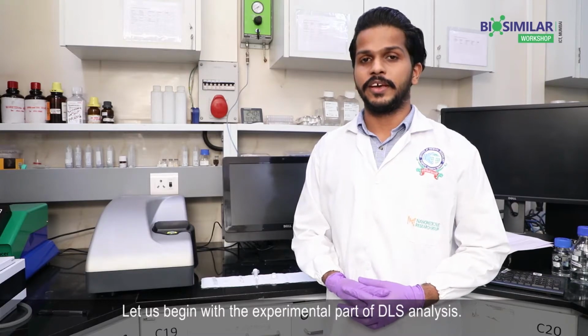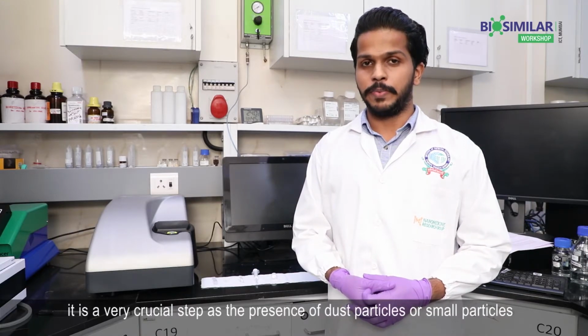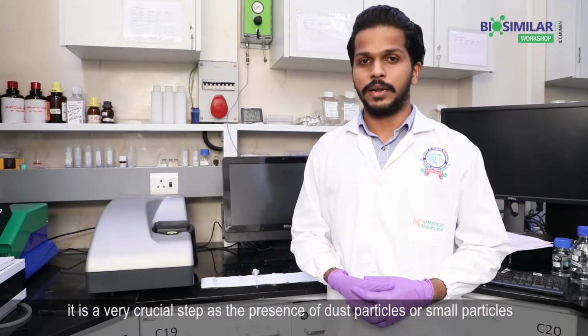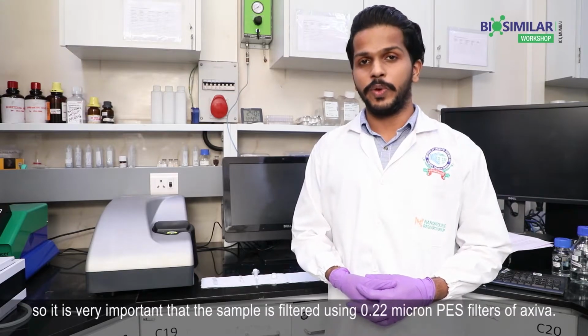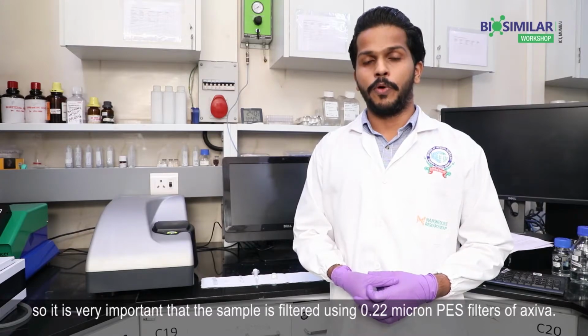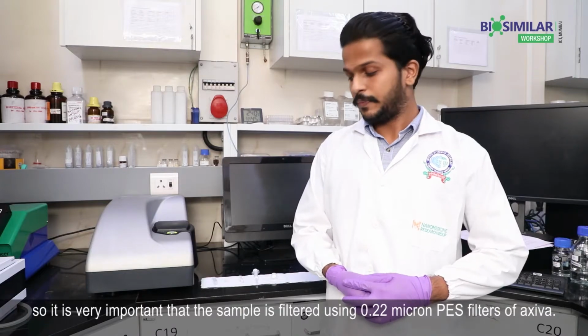Let us begin with the experimental part of DLS analysis. The first step is sample preparation. It is a very crucial step, as the presence of dust particles or small particles may interfere with the DLS measurement. So it is very important that the sample is filtered using 0.22 micron PES filters of Axiva.